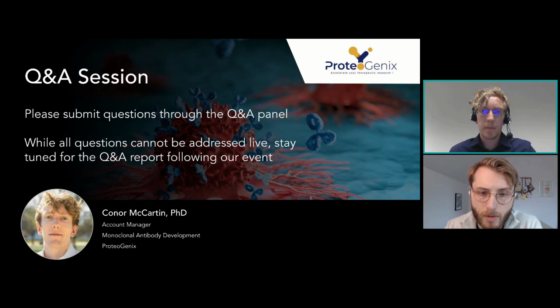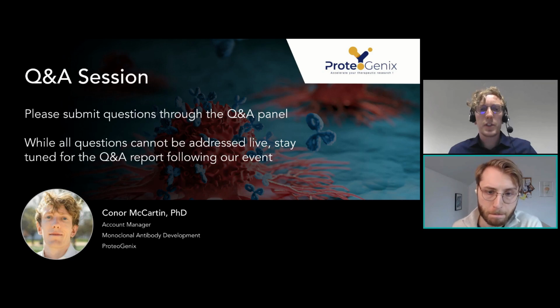Excellent. Another good question here. In your opinion, what bacterial strain is best suited for antibody phage display? For these, we use TG1 bacteria. I believe the reason they are commonly used in phage display is because of the longer pili, which allows them to be better infected by the phages.